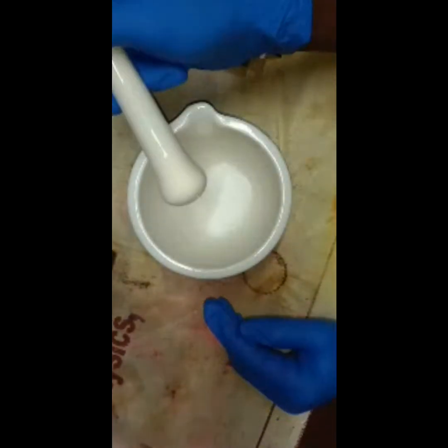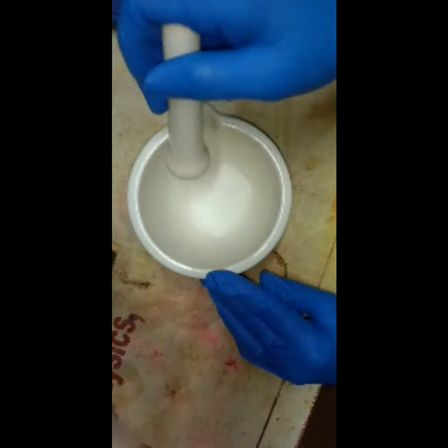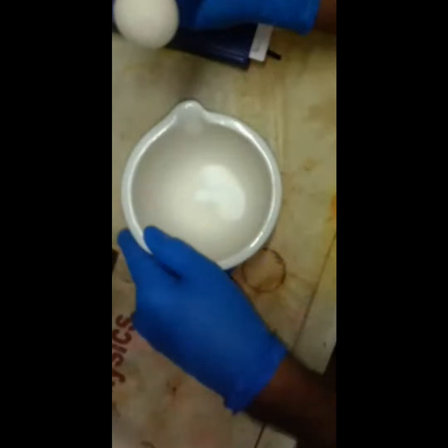We are grinding the nanoparticles synthesized by the sol-gel method. We are grinding the particles a little. So you can see the nanoparticles in powder form.